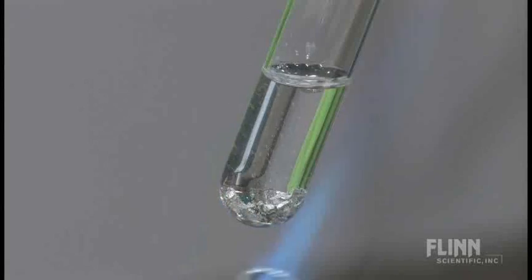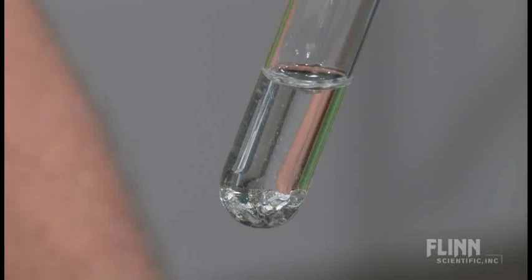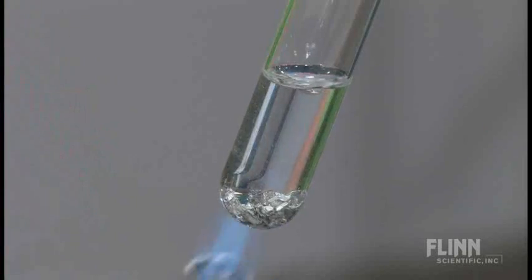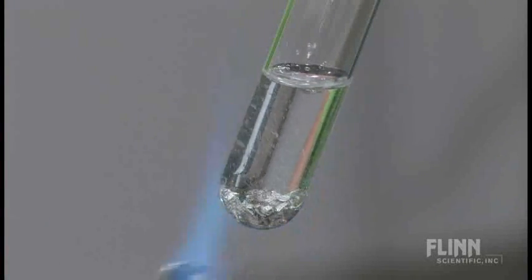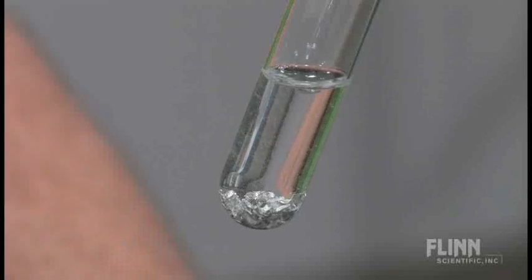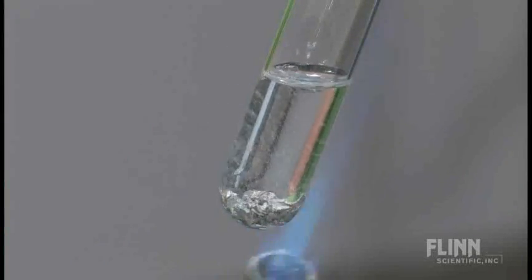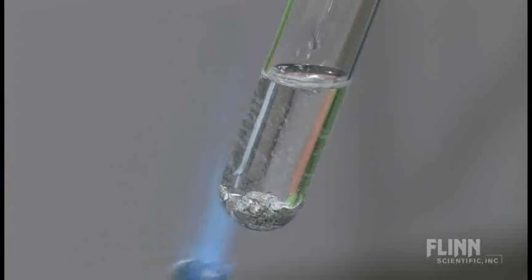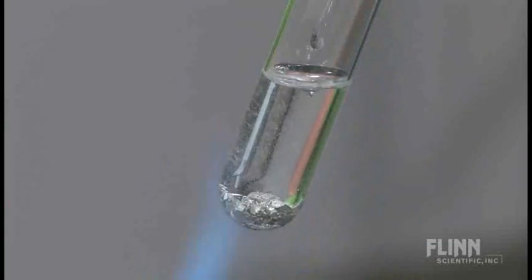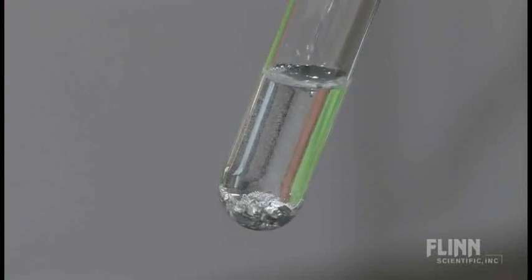Now, I've tried collecting the hydrogen gas that's being generated here, and I've had very little luck with it. Every once in a while I'll be able to get enough that I can get into a test tube and give me a nice popping sound. But it's an iffy process at best. And so I'm not going to even try to do that here. But instead I'm just going to look at another part of the reaction.